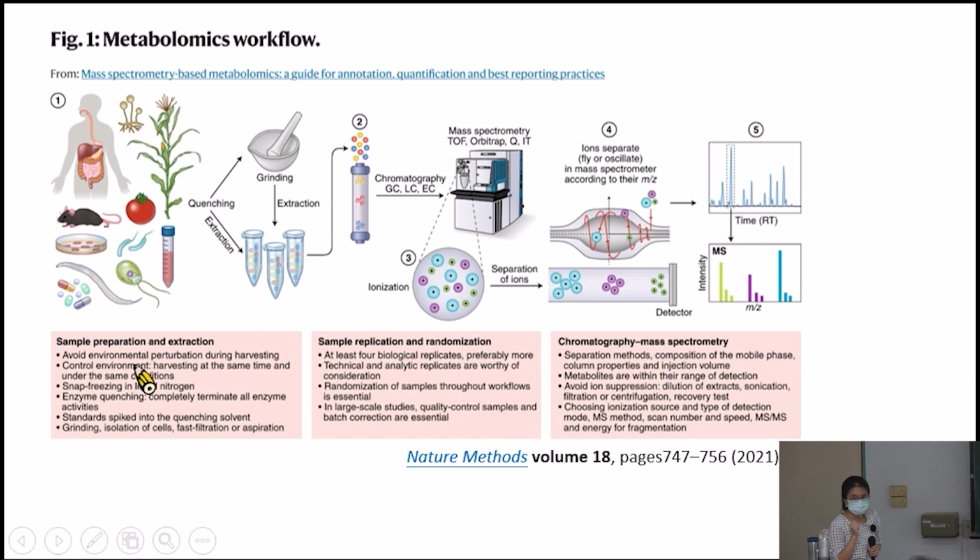Another point the author pointed out is about enzyme activity. If you want to harvest your sample after an enzyme reaction, you need to make sure you have already stopped the enzyme activity, or your sample will show effects from the enzyme, not the real situation within your cells.